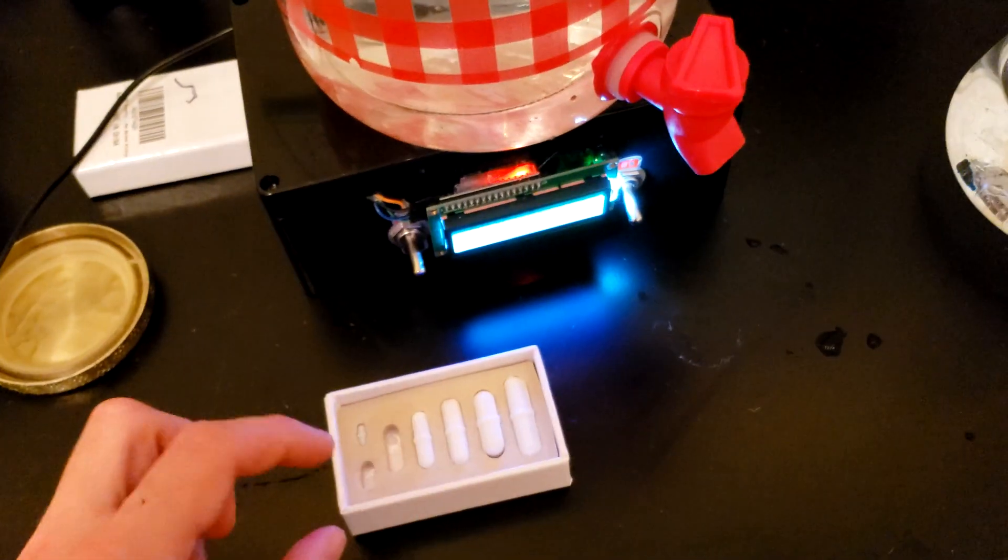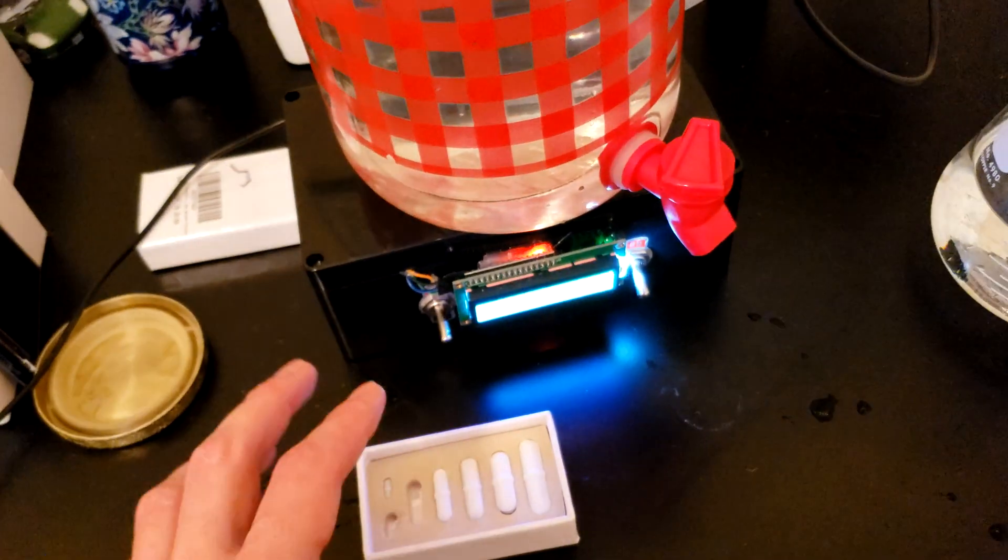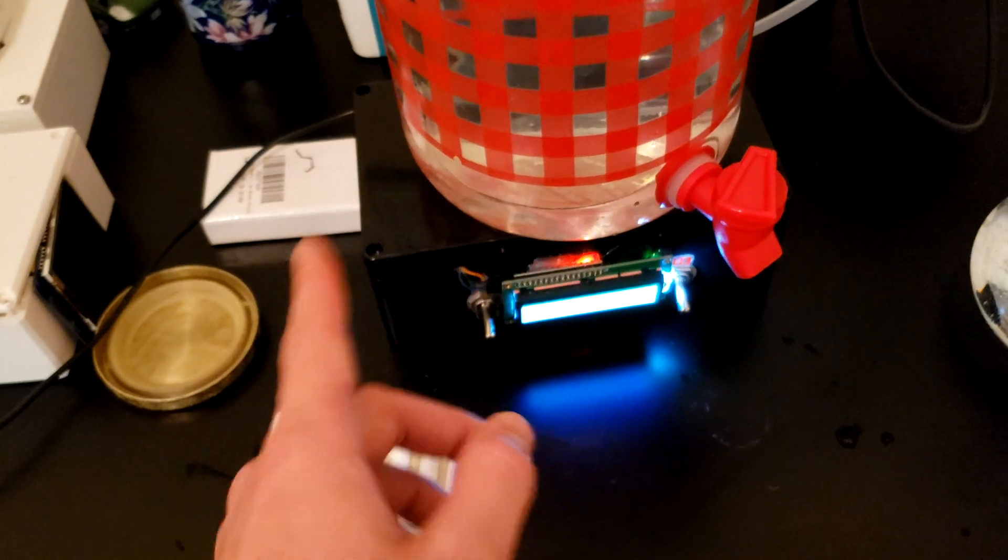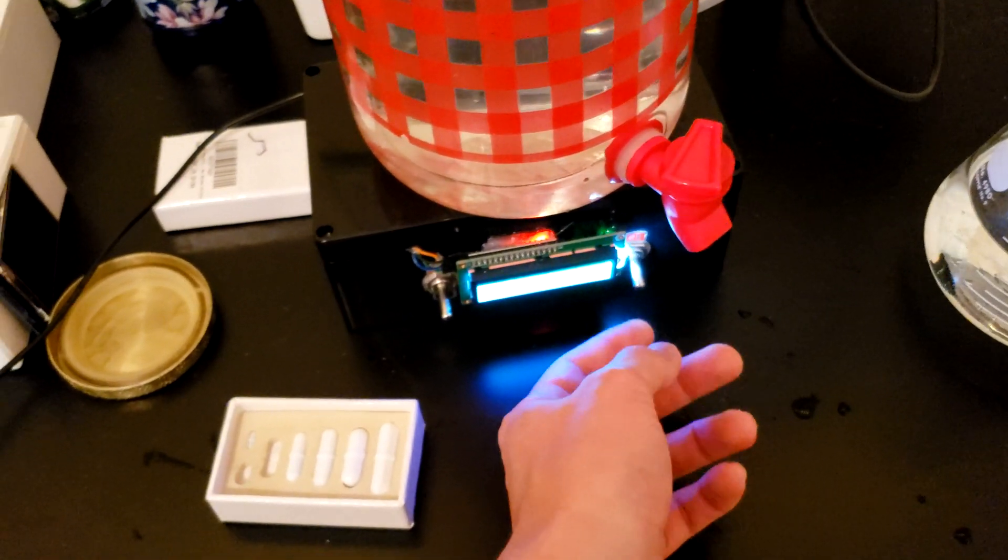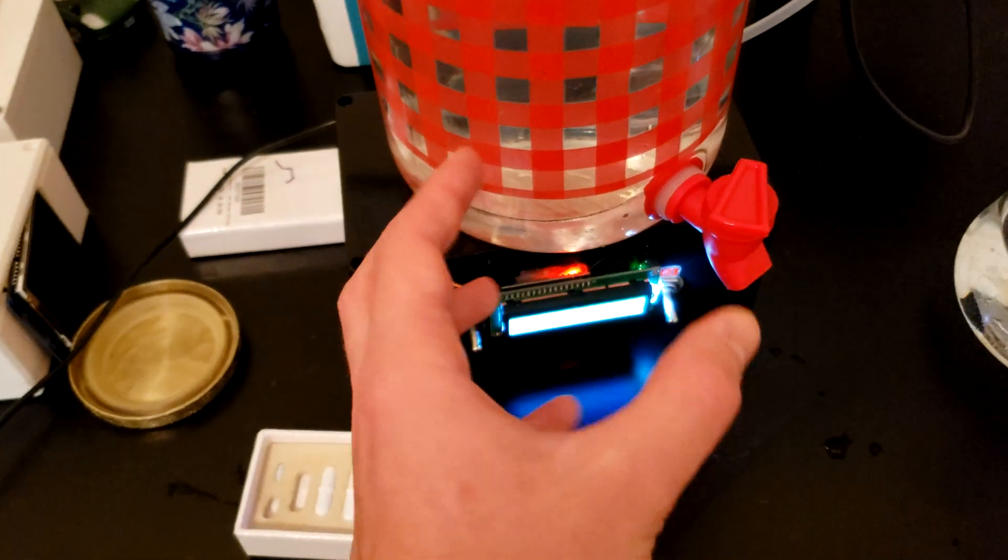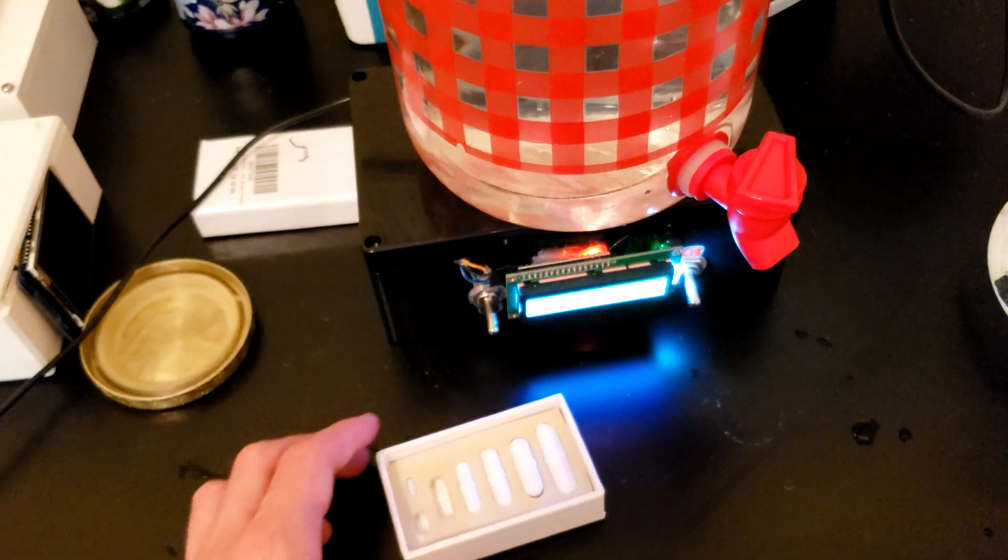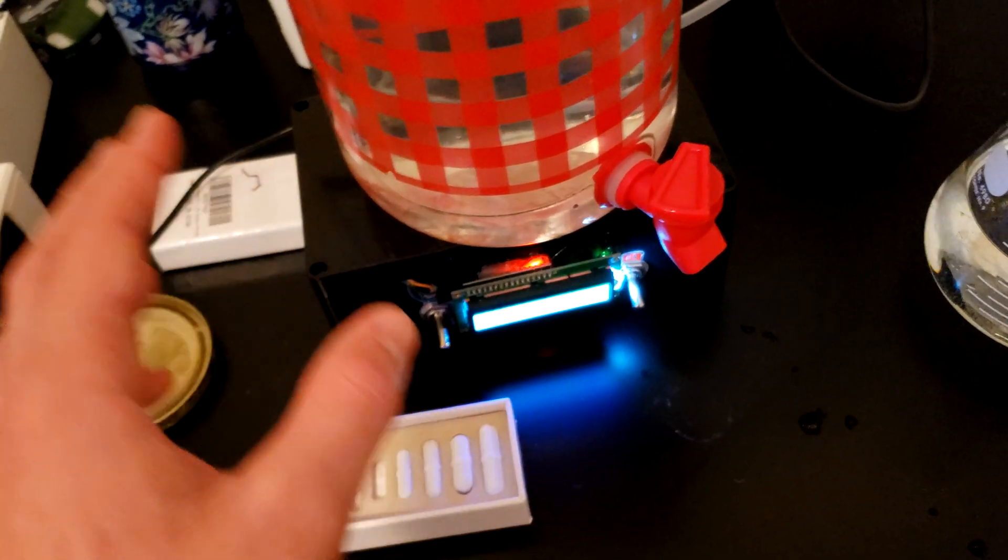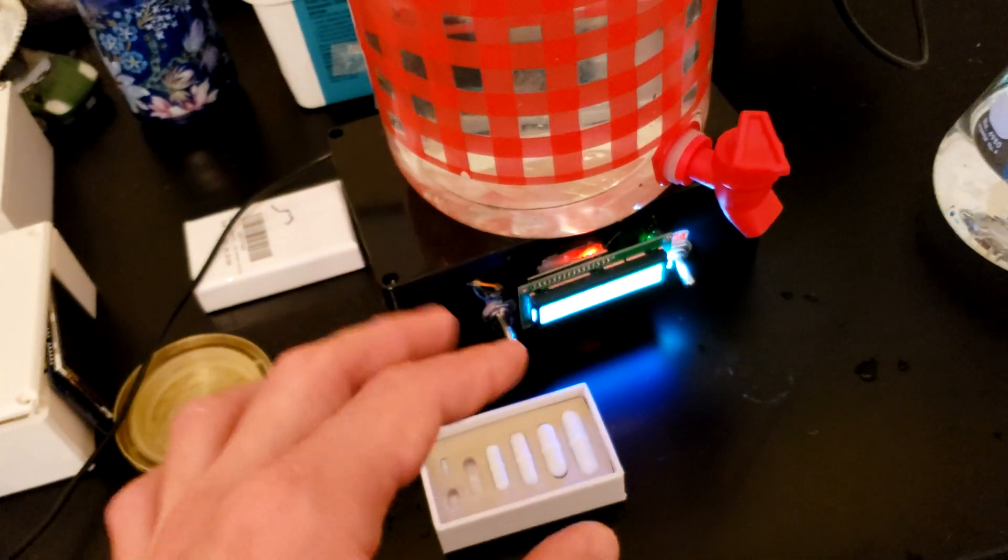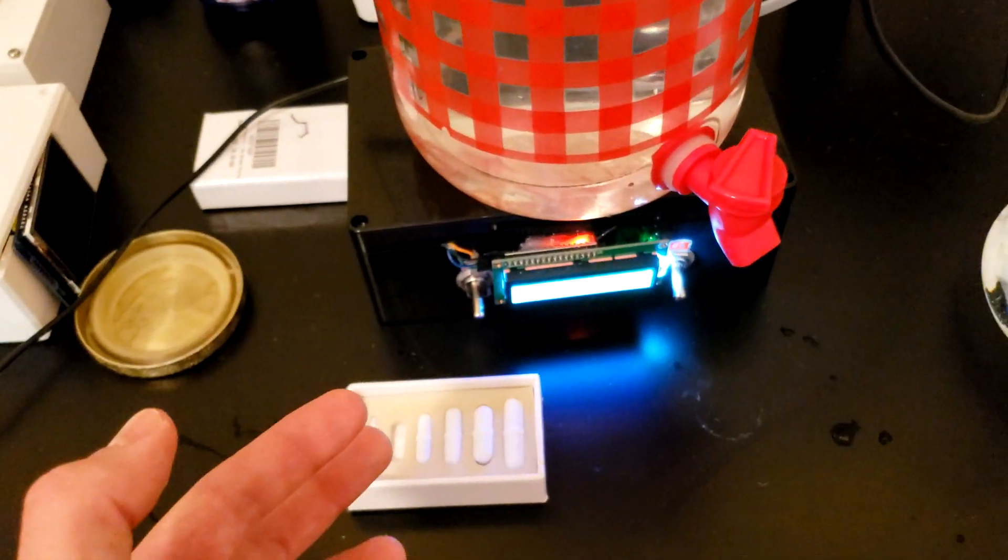If you're ever going to do this yourself, use smaller stir bars if your motor is going too fast. It might be a good way to sort of throttle the mixing rather than having a rheostat here, which I don't have on hand, I just used a switch. So I can just change the size of the stir bar, because I plan on doing continuous applications with this, so it would constantly be on at one speed anyway. So if I have to dial in the speed before the experiment starts, it's not that big of a deal.